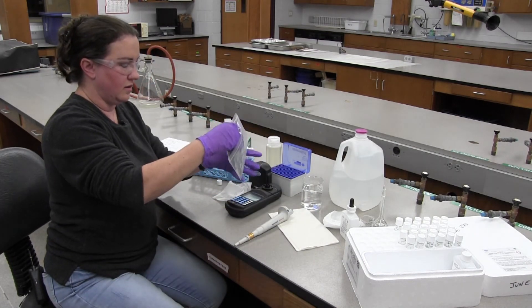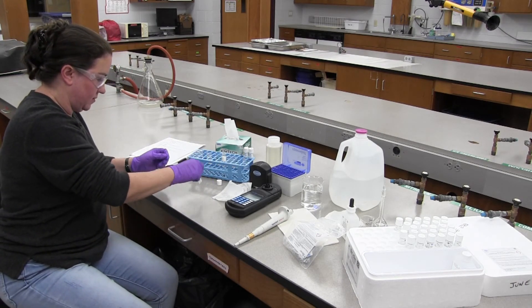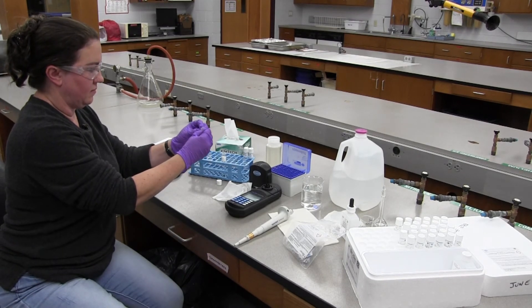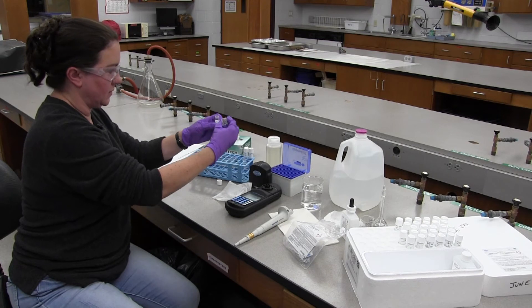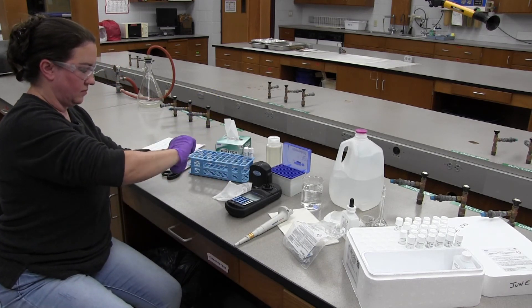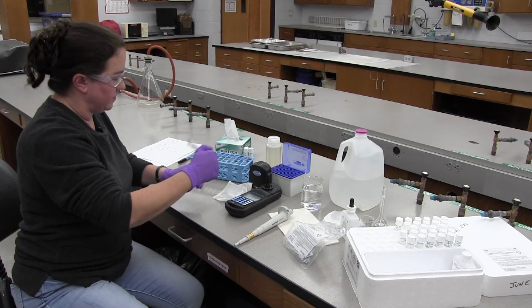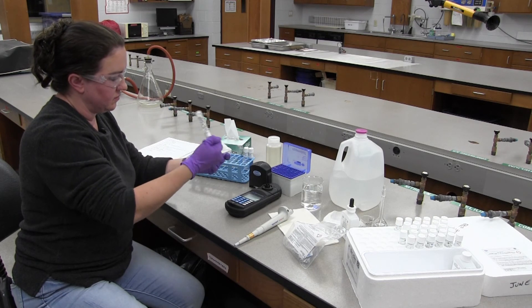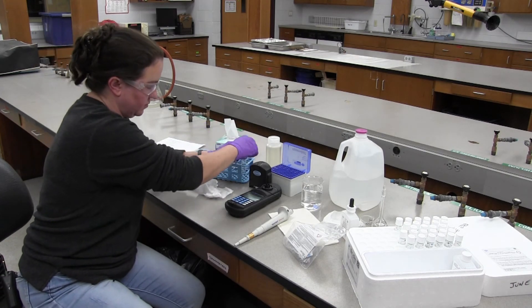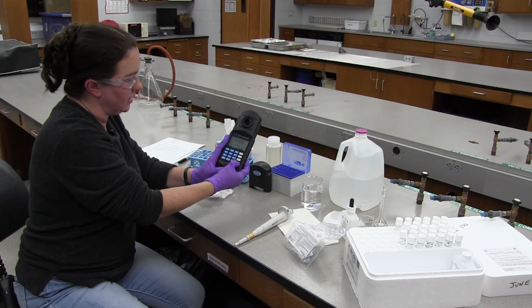We're going to add the reagent powder pillow. Shake it at least 15 seconds. Then I'm going to put the two-minute timer on — press timer, it puts the two minutes up there, and press enter to start the timer.